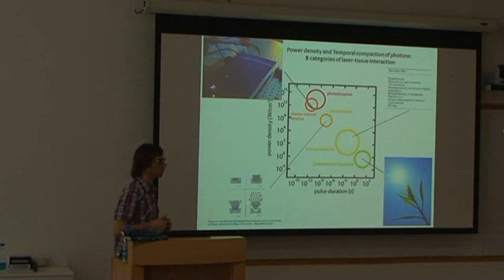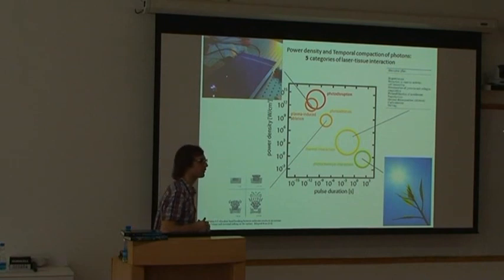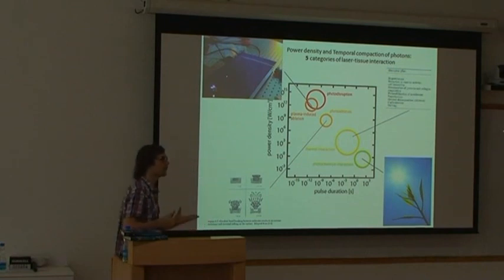The frequency of that sound is the repetition rate. Yes, it's also dependent on the repetition rate. In fact, I had the live experience to see this when I was in Fresnel, in Mosaic, which is an institute of optics and also biology. And they had a laser which had a much lower repetition rate. So it was very slow shocks, but it's exactly this. So it's the repetition rate.